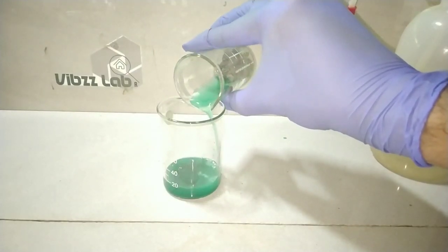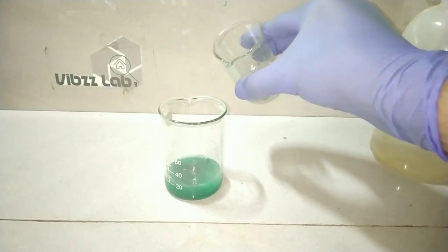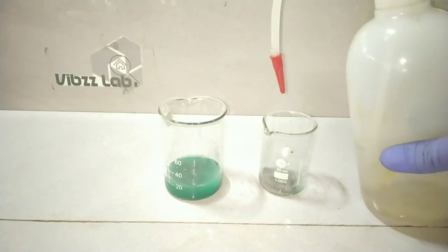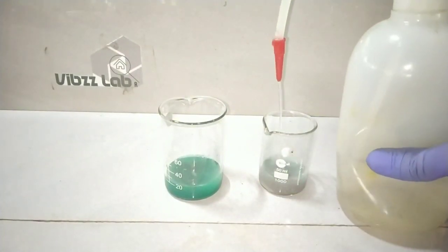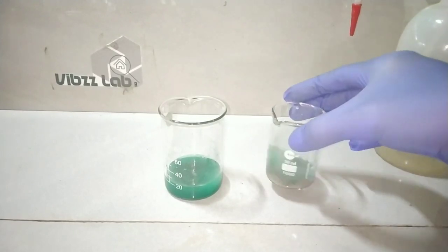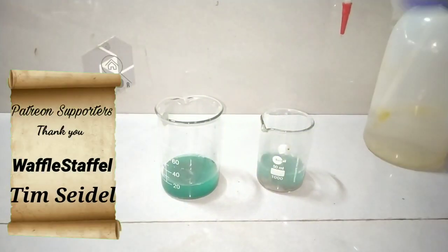I repeated the washing steps about 8 to 10 times. And I have tried to remove most of the copper contamination from it.